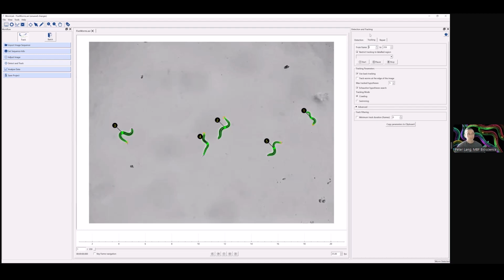All right, so tracking uses a deformable model estimation algorithm that fits that geometric model from the previous frame to the current frame. So on a frame-by-frame basis, we're going to apply this deformable model. Now, in the event that there's frames where there's some type of interaction, say, starting here at frame 245, this is where some worm trackers run into some difficulty and will stop tracking.